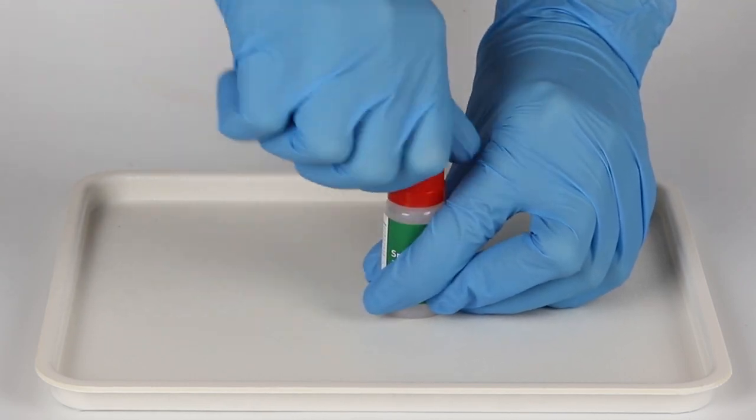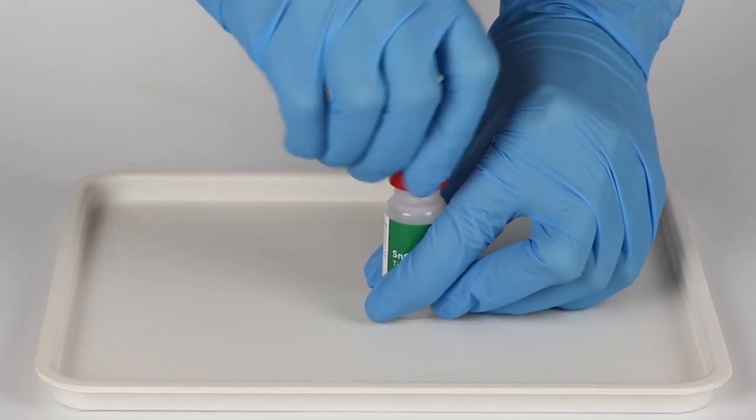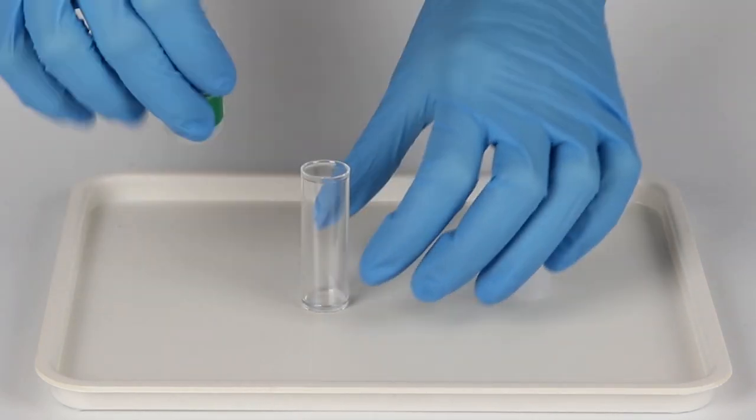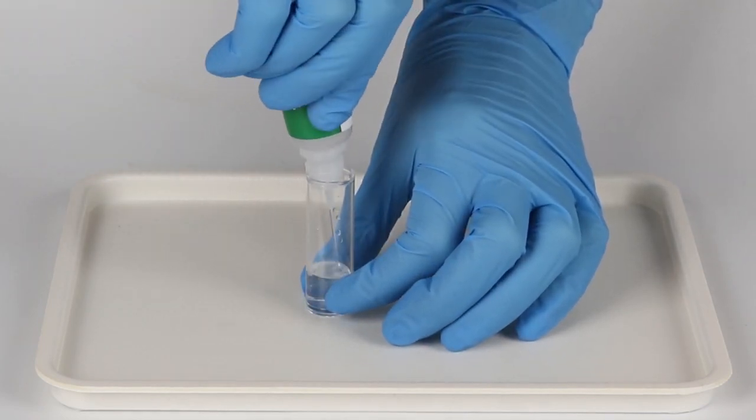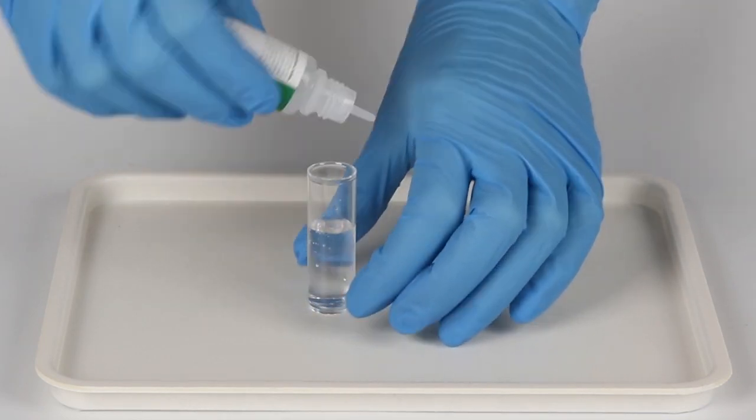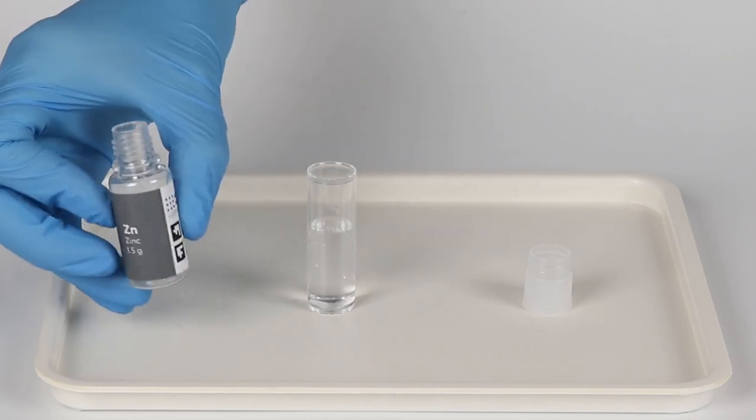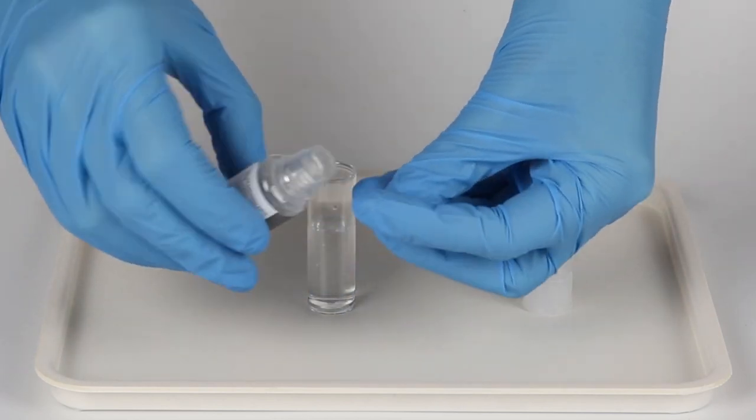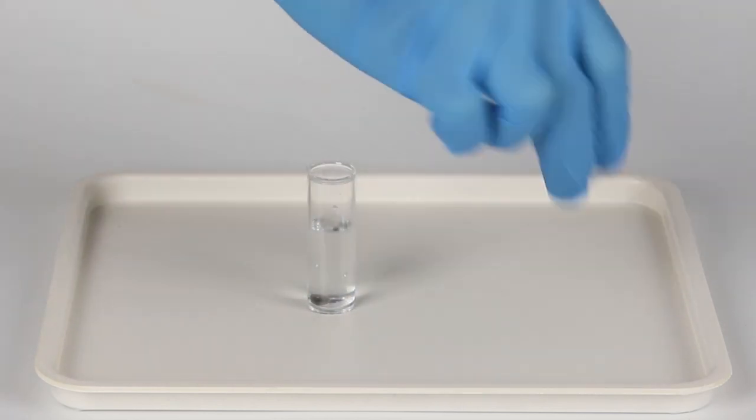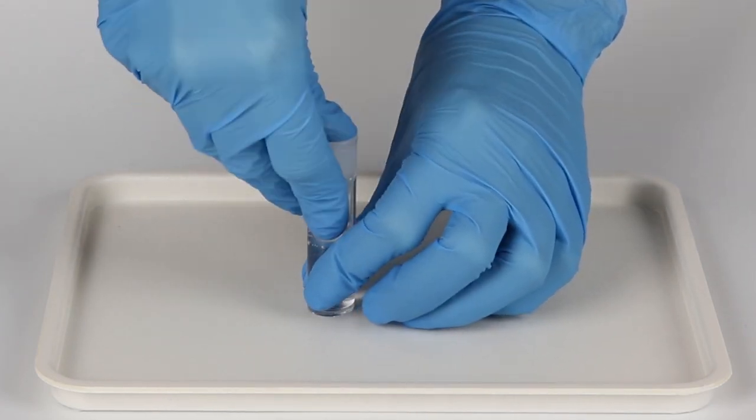Now, open the bottle again and fill the vial approximately to its halfway point with the obtained solution. Take a zinc pellet and drop it into the vial. Seal the vial. The hedgehog will grow right before your very eyes.